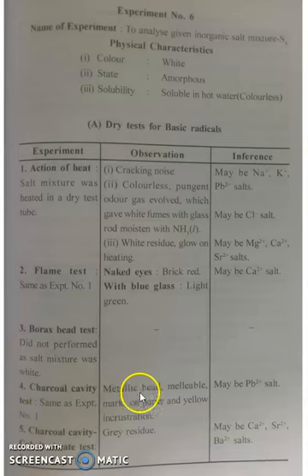If you see metallic beads or malleable marks on paper and yellow incrustation, then maybe Pb2+ salts. And then charcoal cavity or cobalt nitrate test: gray residue, maybe calcium 2+, strontium 2+, barium 2+ salt.